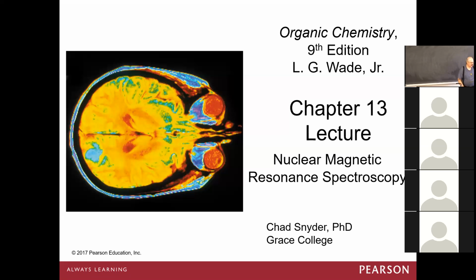Okay, nuclear magnetic resonance spectroscopy. Despite the term nuclear, this doesn't involve radioactivity, or it usually doesn't.